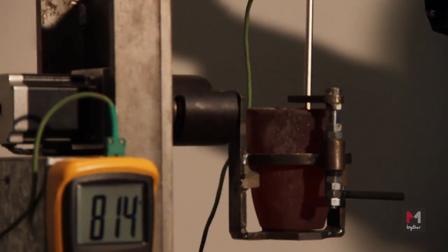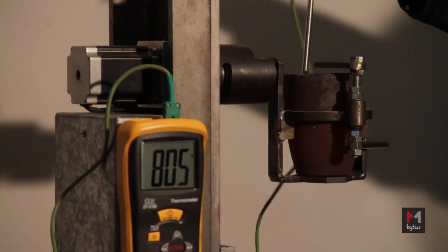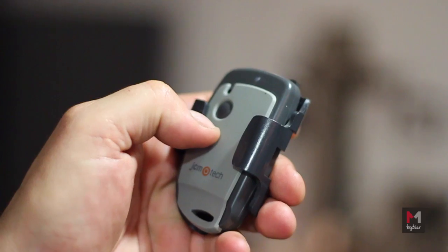The result of the test — Pass or No Pass — will depend on the status of an underneath PVC layer that simulates the human skin. In a fabric where the hot metal sticks to it, the heat passes through the fabric and usually damages the skin simulator.